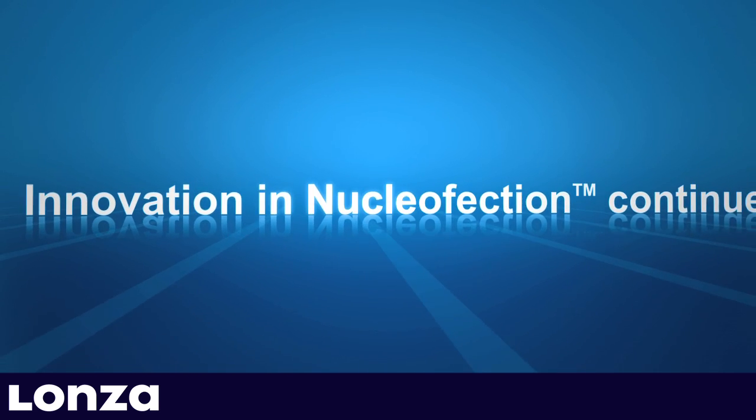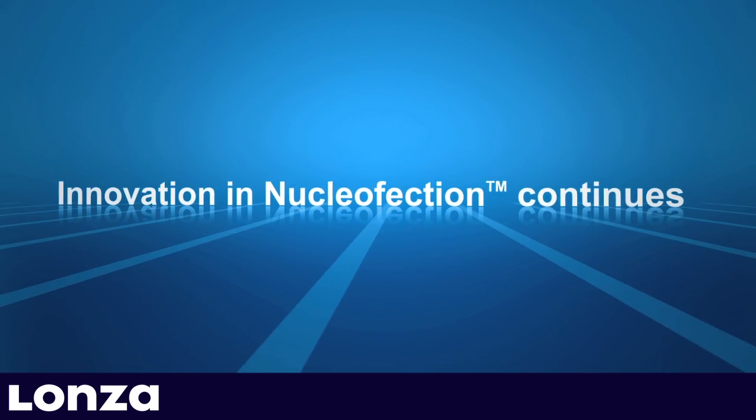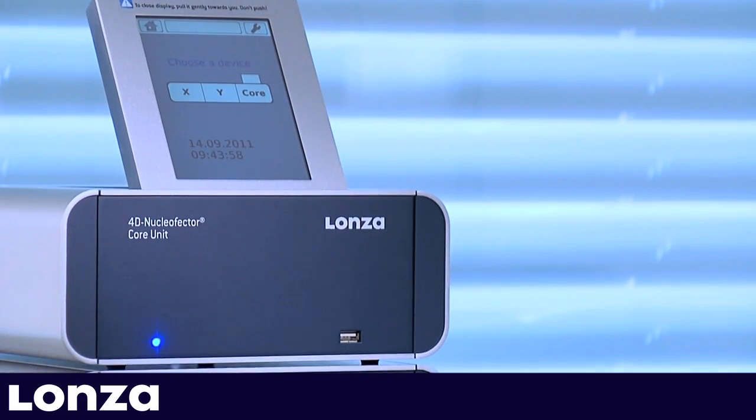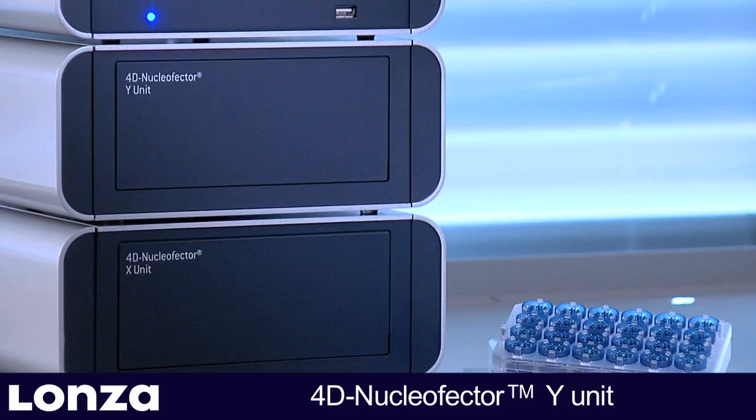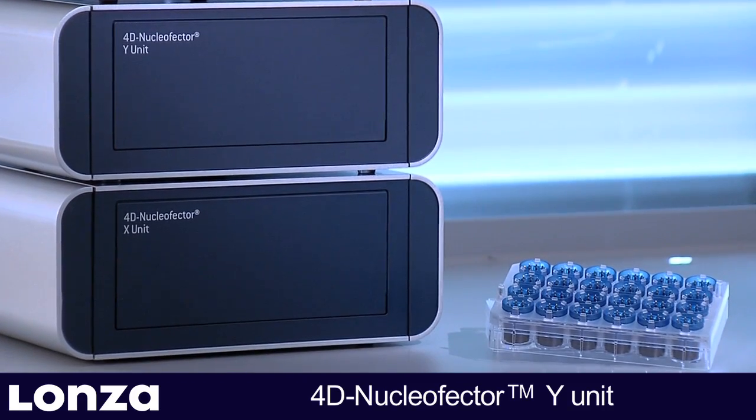Innovation in nucleaffection continues. The 4D Nucleaffector Y-Unit, enabling adherent nucleaffection in 24-well culture plates.